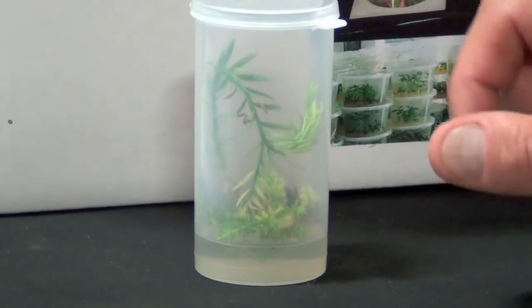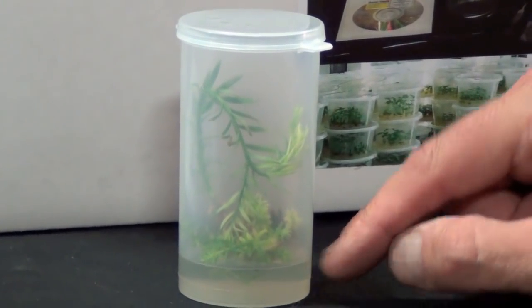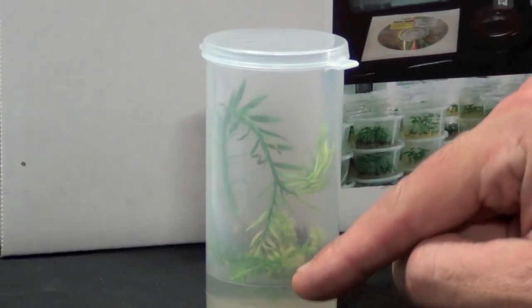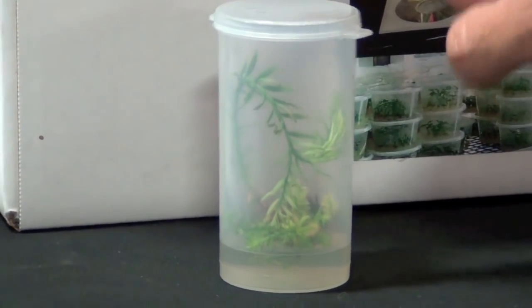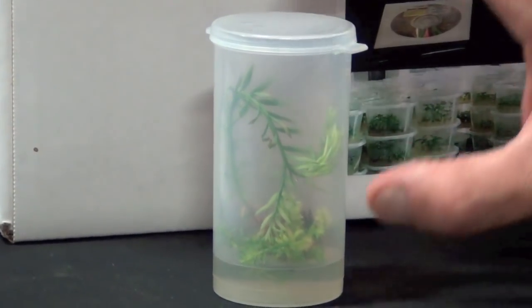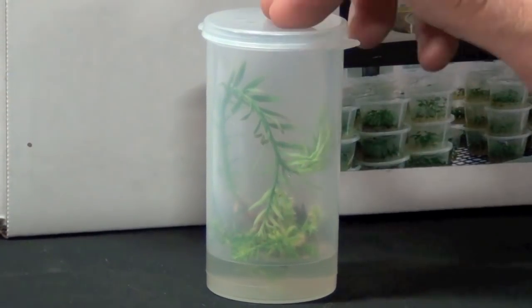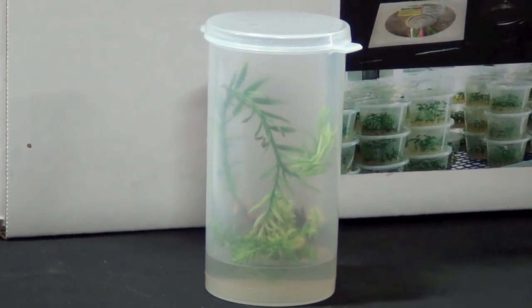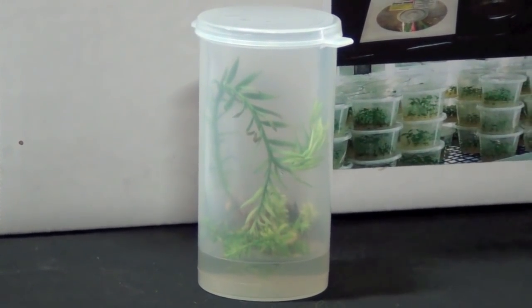I'll take those branches and either root them directly into plugs, or move them into the rooting version of tissue culture. That'll still leave me the original nugget that these are all growing from, which I'll move into a brand new multiplication bottle, and it'll grow all over again. This is self-contained — we're not looking for so much photosynthesis, as the sugar is giving it energy to grow. The container helps keep it small, just like a fish grows to the size of its tank. The hormone is going to give it a direction — in this case, stay short and give me lots of branches. That is the multiplication version of tissue culture.